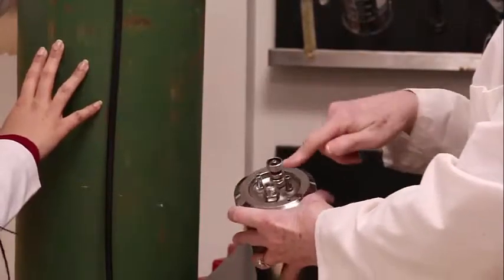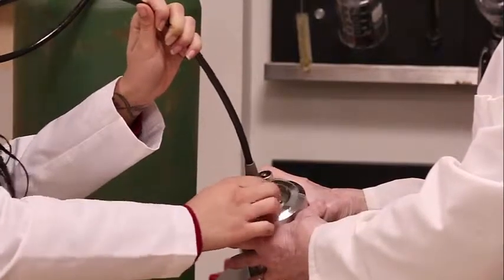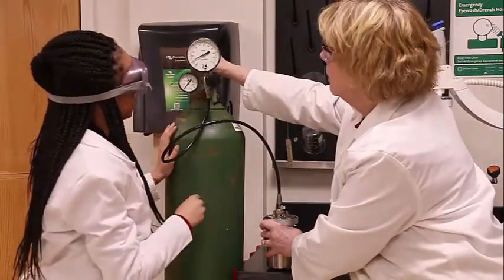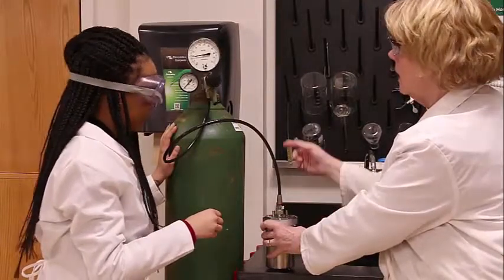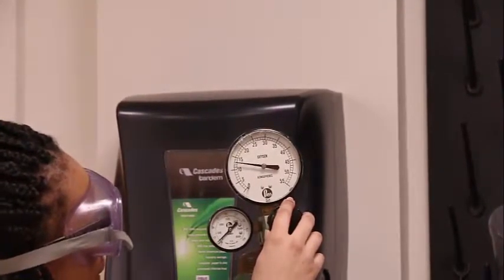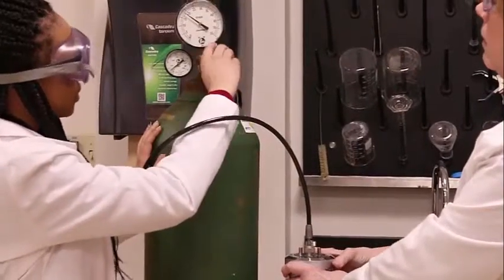Open the vent to the bomb and attach the correct oxygen hose corresponding to your calorimeter lid. Slowly turn on the oxygen and allow the nitrogen to bleed out for a few seconds. Close the vent and fill to 25 atmospheres. Do not fill past 30 atmospheres. Turn off the oxygen, and disconnect from the bomb.